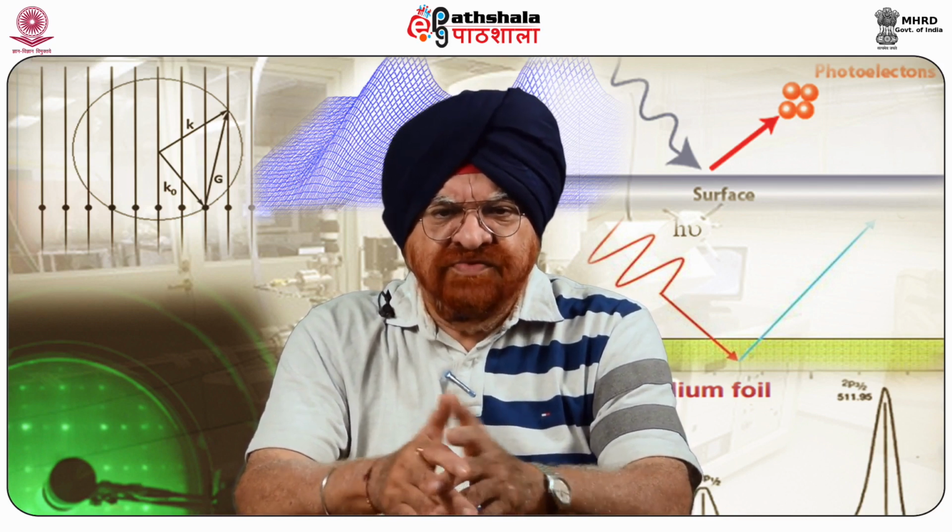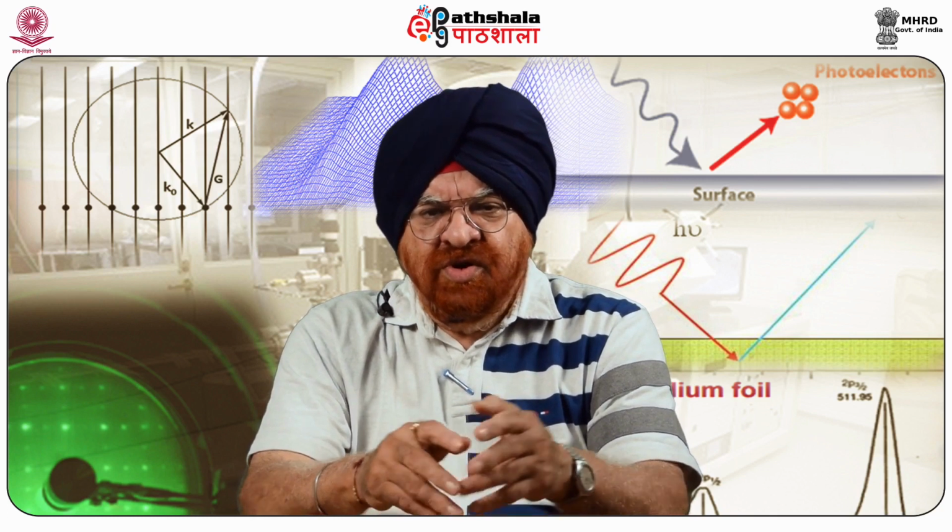Then when we come down to the components which are used for this, we have the electron source. A device used is an electron generator. That is the one which is used to focus on the surfaces. And from here, we go to the monochromator.